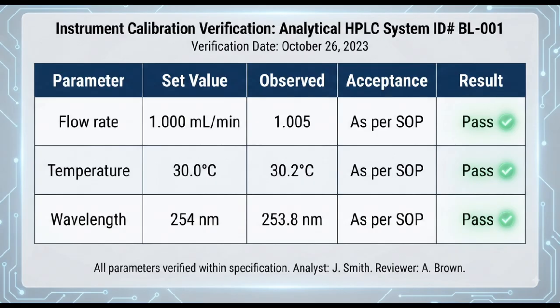The important point is that we should never decide pass or fail based on personal assumptions. The result must be compared against the approved acceptance criteria.